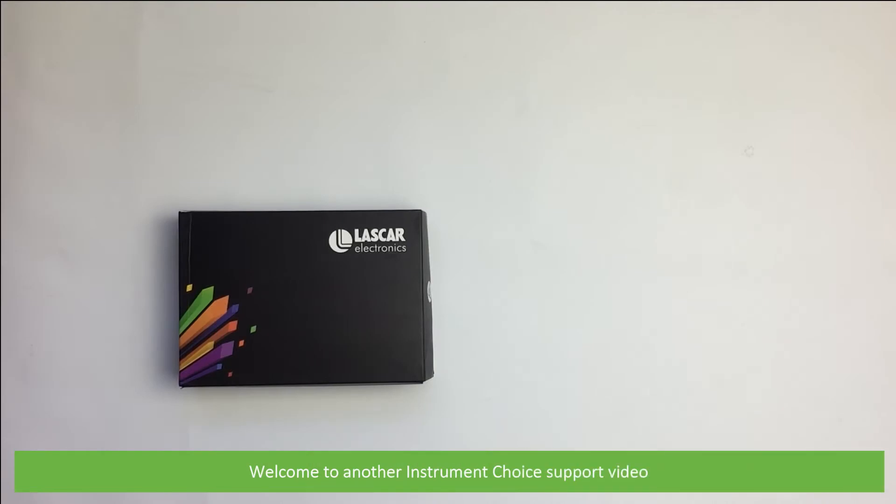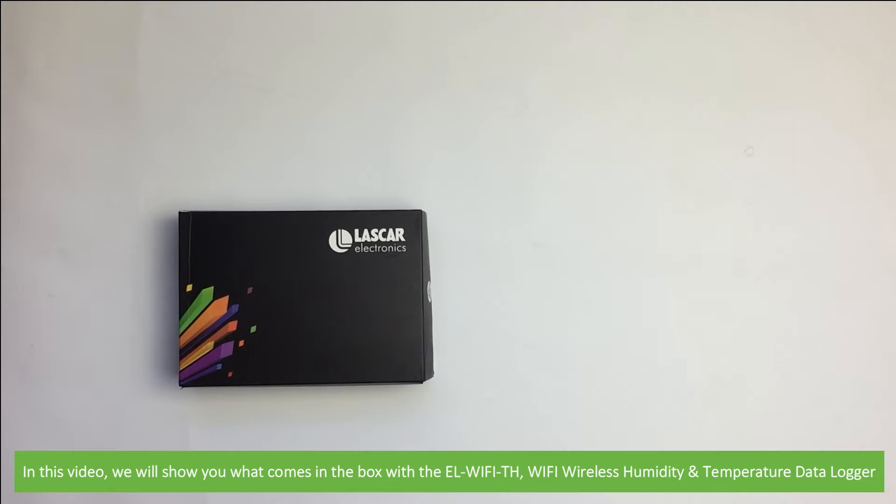Hi and welcome to another Instrument Choice support video. In this video we'll show you what comes in the box with the EL Wi-Fi TH Wi-Fi Wireless Humidity and Temperature Data Logger.